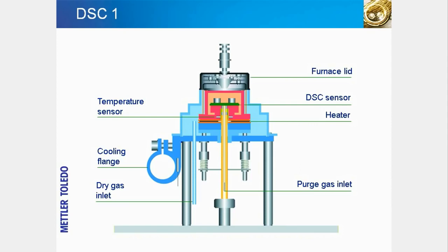When an intracooler is used, a cooling flange is placed around the oven for direct and effective cooling. For cryostats, a cooling flange is provided that holds the cooling finger of the cryostat. Depending on the temperature range of the measurement, either one or both of the gas inlets illustrated in the diagram are used.